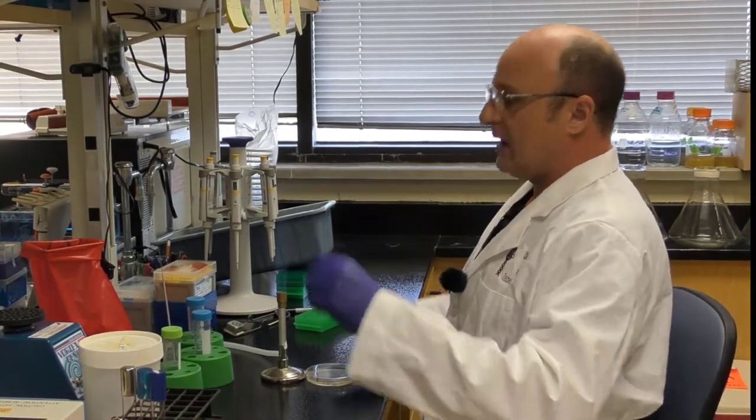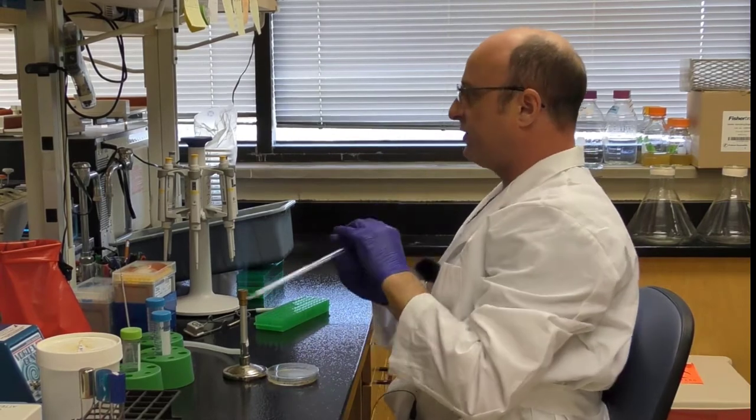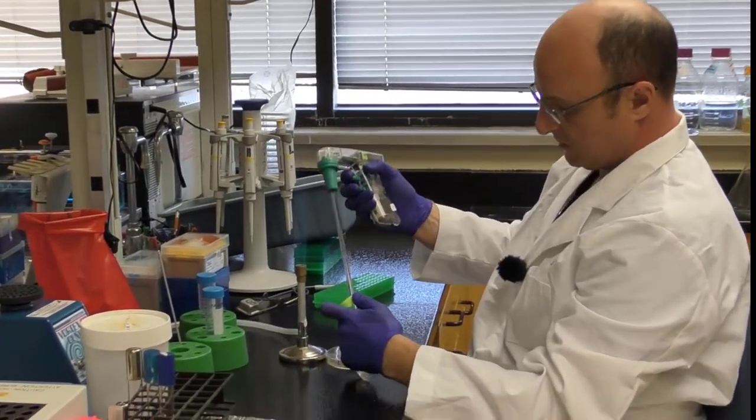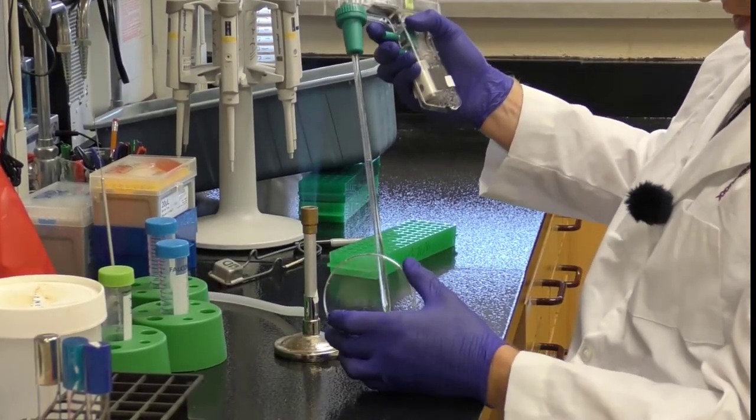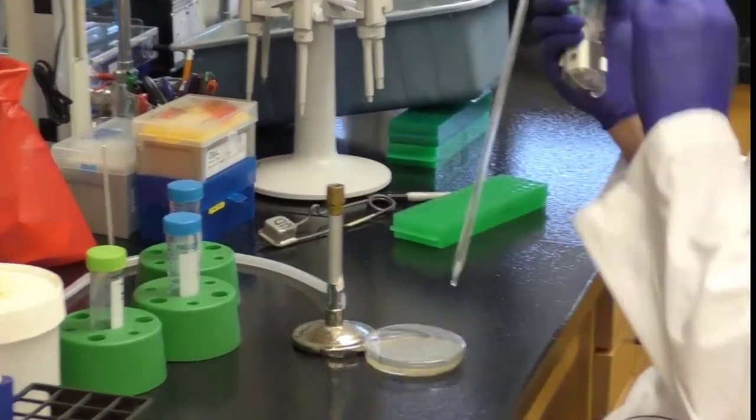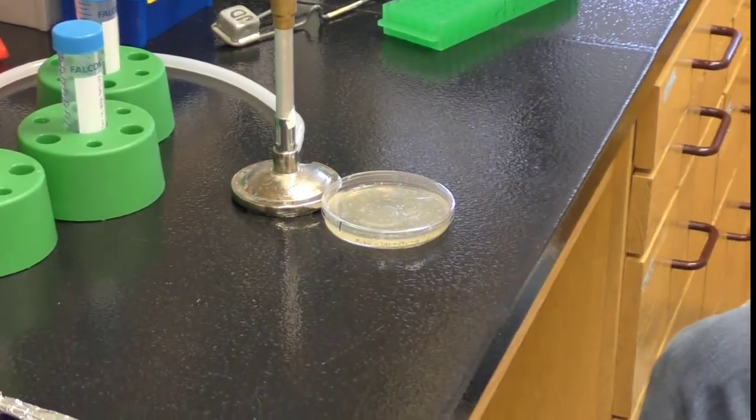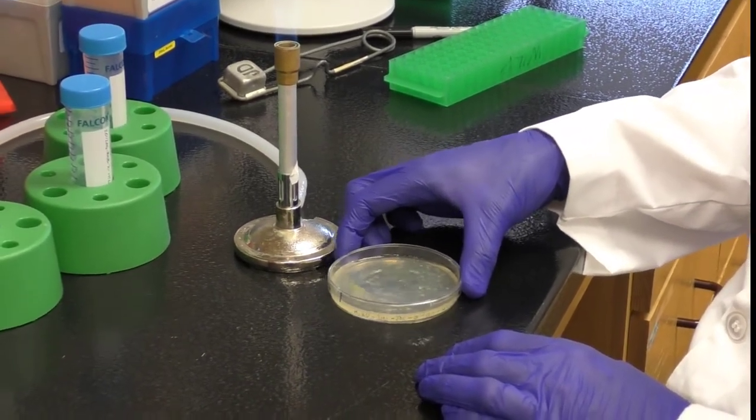I'm ready to go. So in this case, for the class, we'll be doing five plates for each student, but I'm just going to demonstrate with a single plate here. But all you're going to do is just repeat this five times over. So the first thing we do is we flood the plate with four mils of buffer. And when you're doing multiple plates, it's probably easier to get one 25 mil pipette and just do four mils, aspirate up 20 mils and just do four mils into five plates in one go. So the plate has been flooded, and if you look, you can see already that some of that soft agar is coming loose.